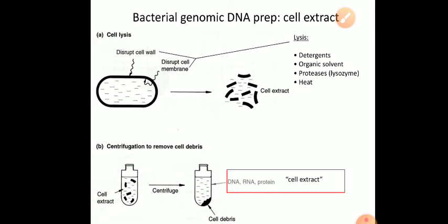Okay, so now once you have grown the organism in broth culture, the next thing is separating the microbial cells, that is separating the bacteria from the broth, because organisms are present in broth, right? So you separate the broth and you separate the culture, that means you separate the microbial cells. For that, the broth culture is taken in centrifuge tubes. The tubes are centrifuged so that the liquid medium and the microbial cells get separated.